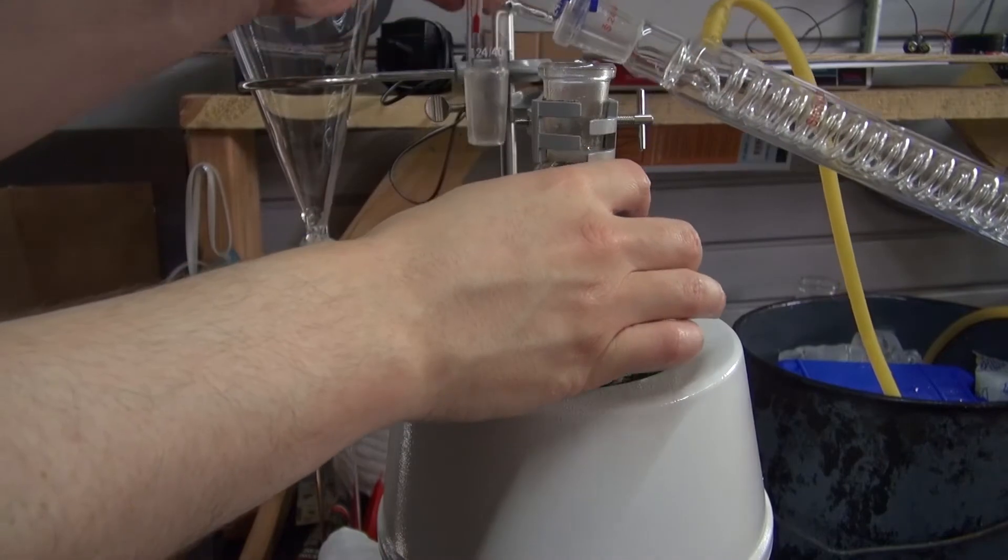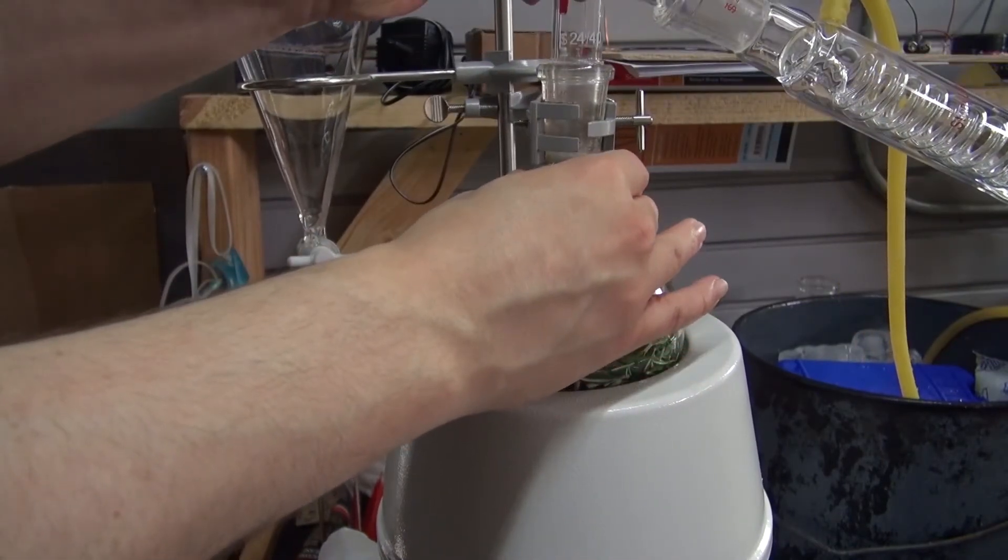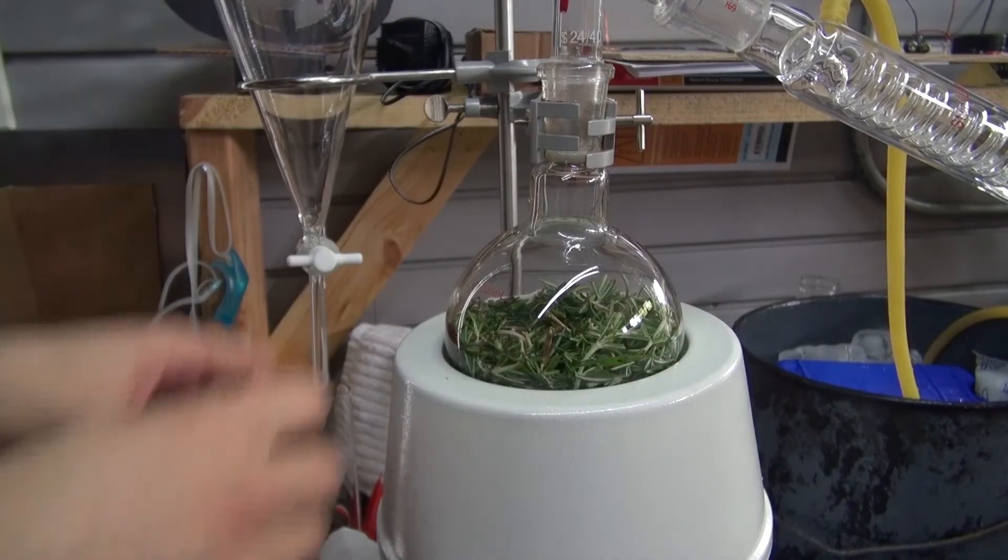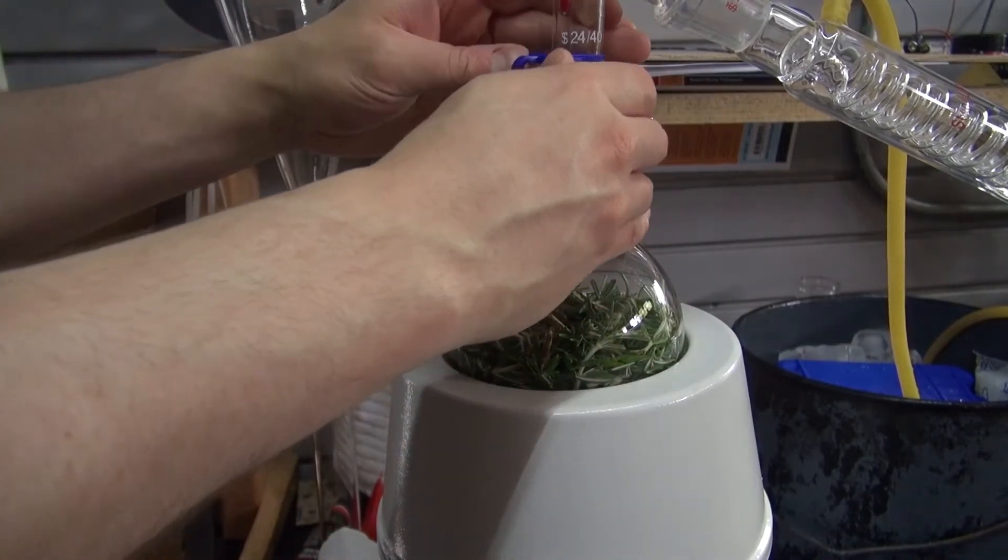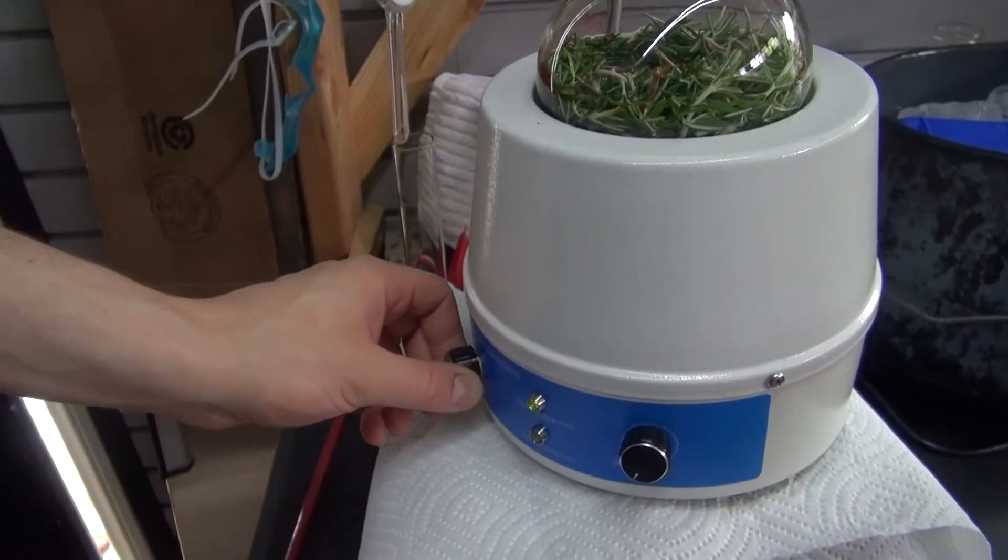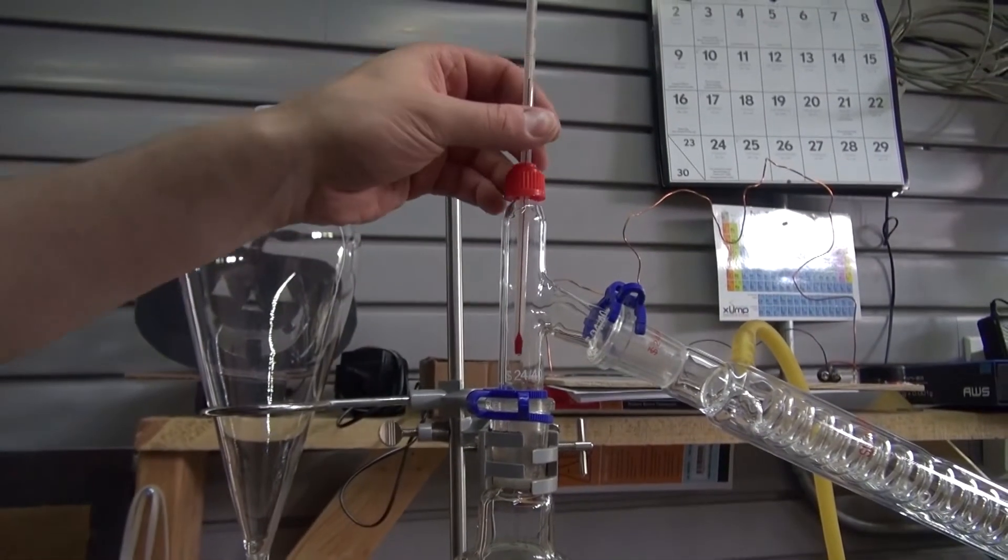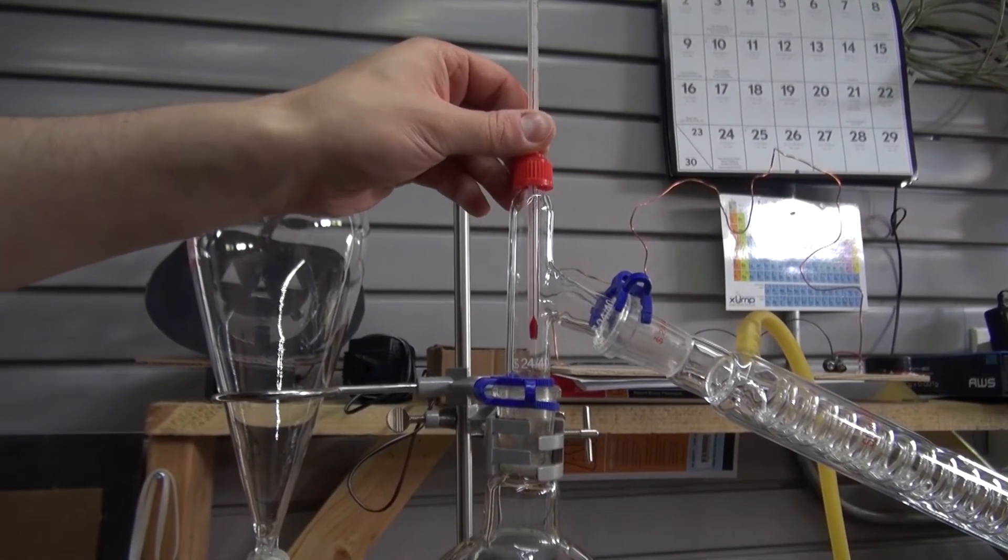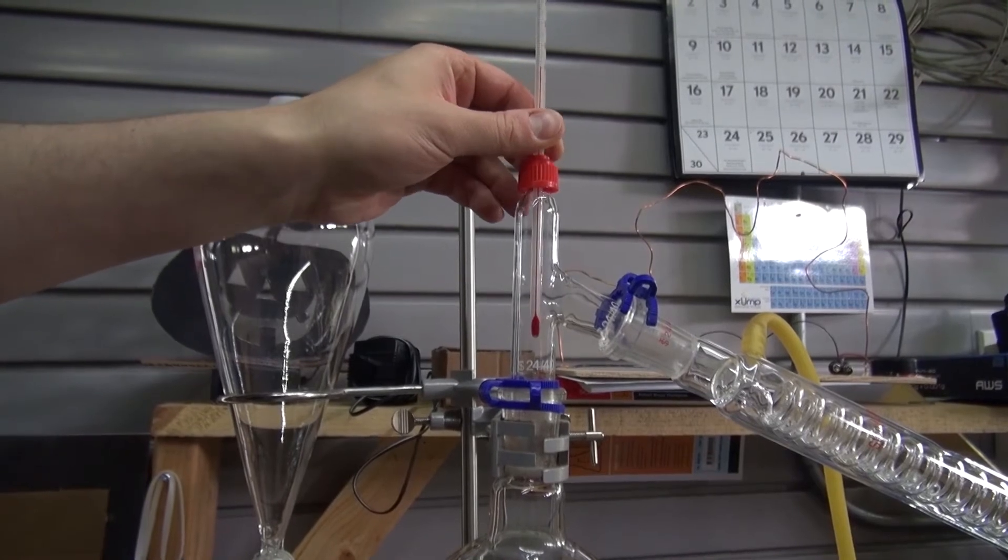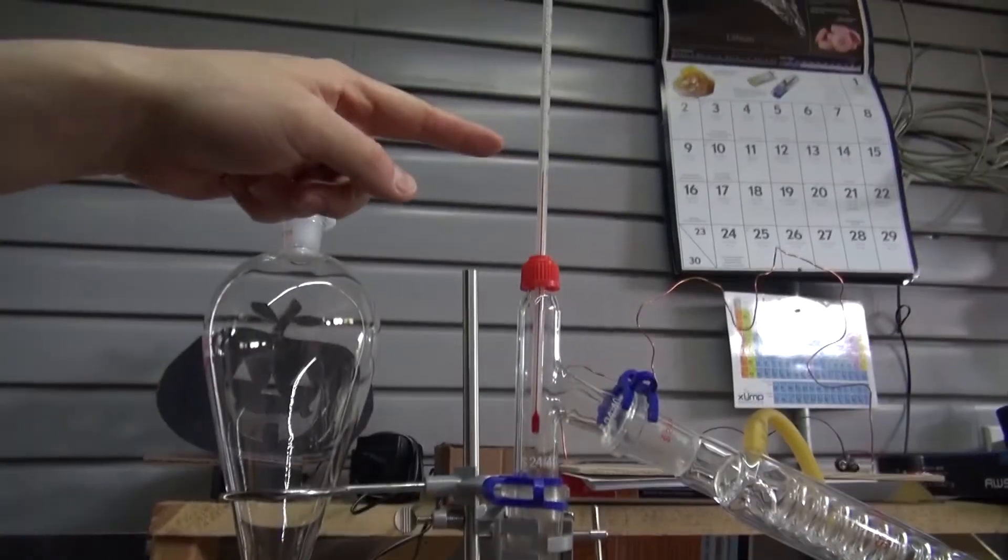Connect the two joints together and put the joint clamp in. Now turn on the heating mantle and turn it up to nearly maximum. Next adjust the thermometer to make sure it's measuring only the steam so that when it reaches 100 degrees Celsius your distillation process is ready to begin.